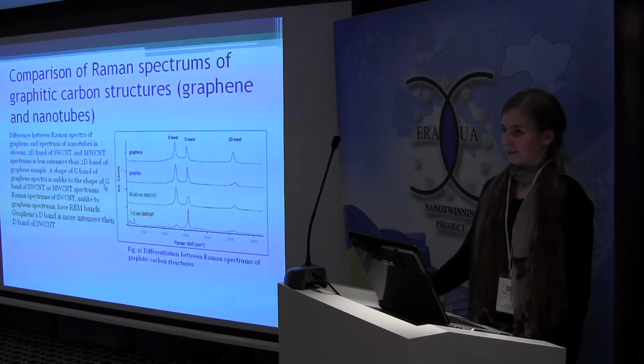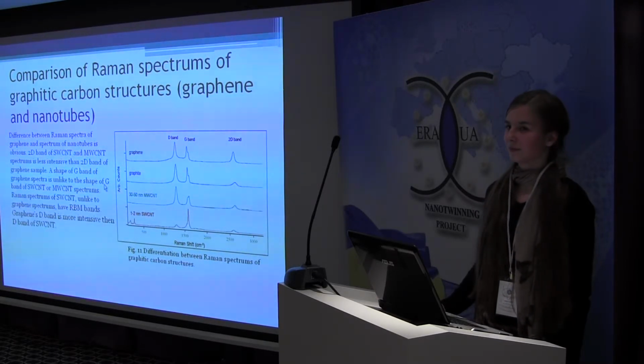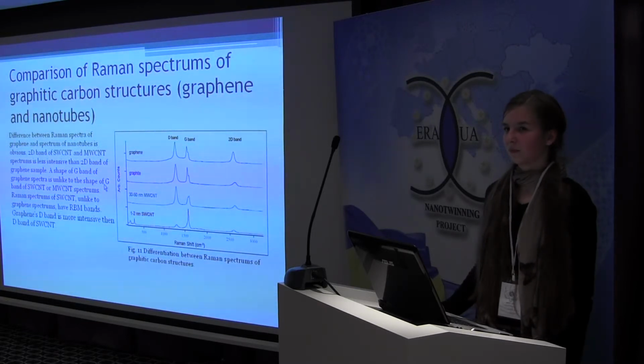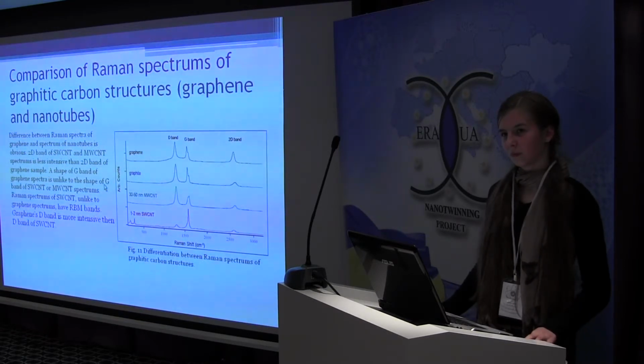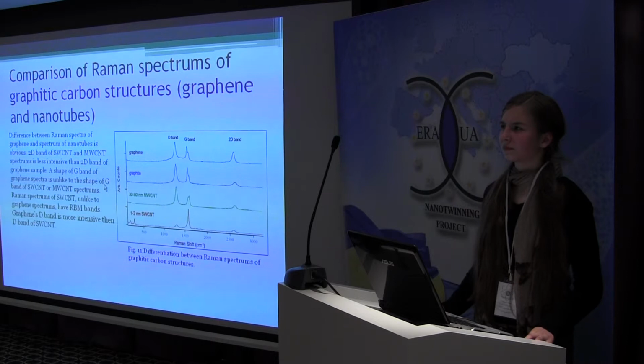Okay, any questions? Okay. So, just such a question: if you compare the intensity of the G band and D band for different materials, can we connect these intensities with the amount of defects in such materials, or is it not so strict?